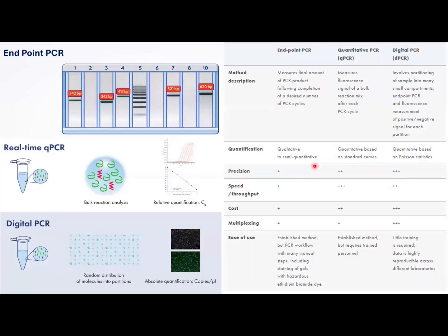So coming on to the different kinds of PCR which are available. As previously told, this is the end-point PCR. In end-point PCR, you lock up everything into a tube, you put it into a PCR thermal cycler, and you use ethidium bromide gel electrophoresis to document the presence of the fusion transcript. So this is, for example, the patient sample.